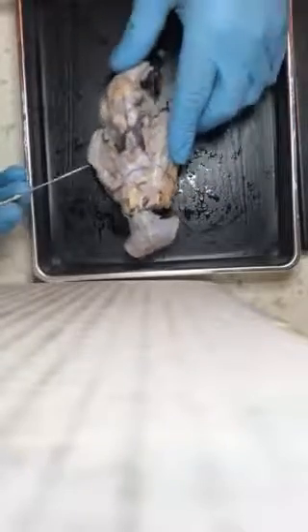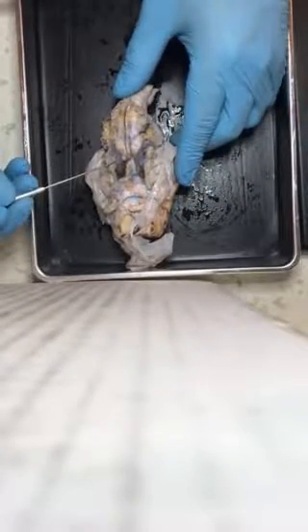The pituitary gland is going to be right here. This is the pituitary gland.